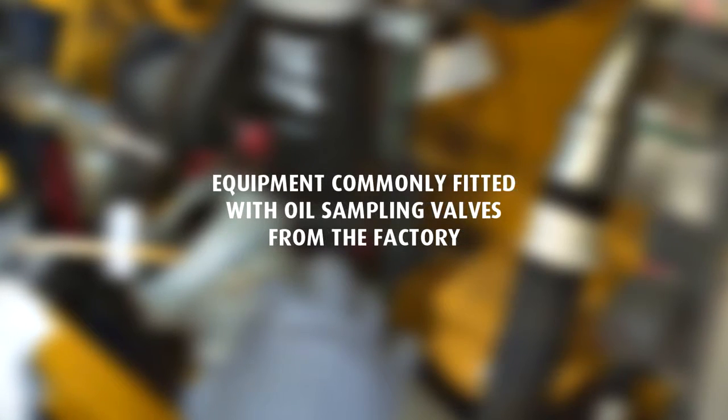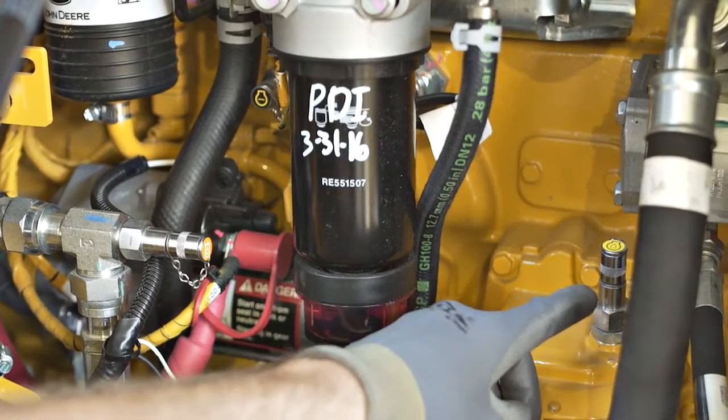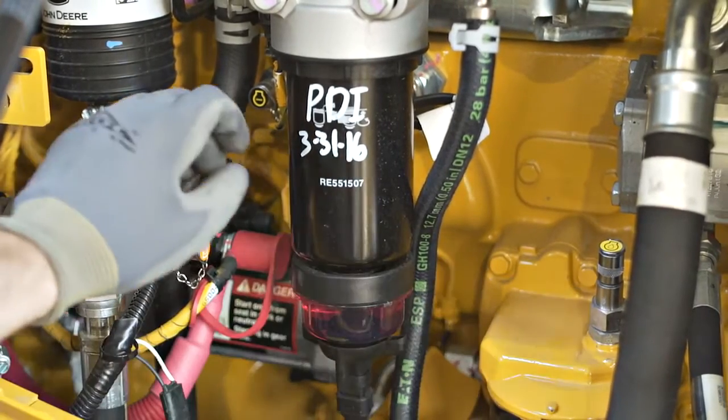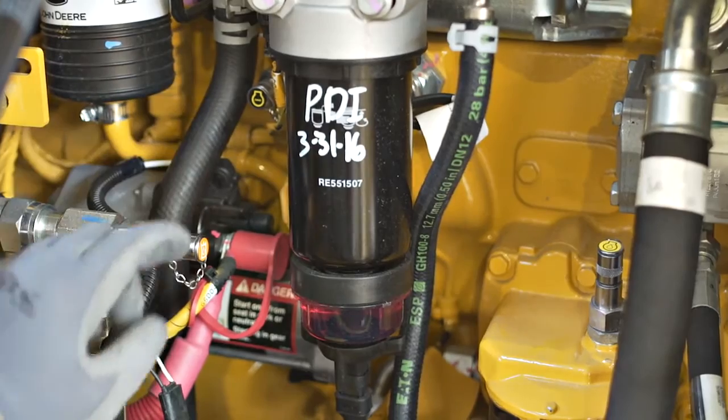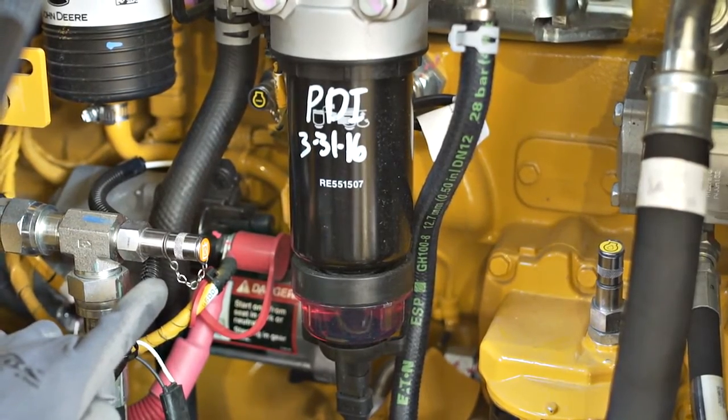Equipment is commonly fitted with oil sampling valves from the factory. If installing an aftermarket inline sampling valve, they should be installed upstream of any filter in order to capture wear particles and preferably on return lines.